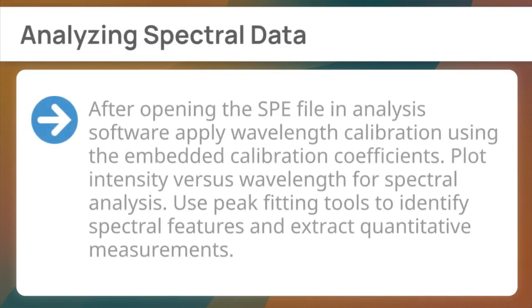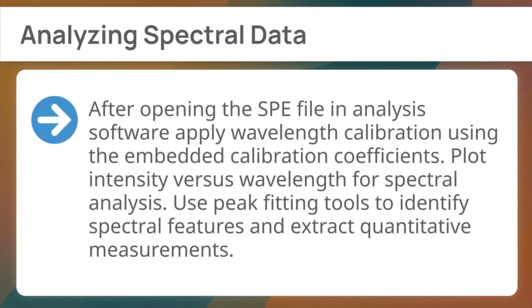Next, analyzing spectral data. After opening the SPE file in analysis software, apply wavelength calibration using the embedded calibration coefficients. Plot intensity versus wavelength for spectral analysis. Use peak-fitting tools to identify spectral features and extract quantitative measurements.